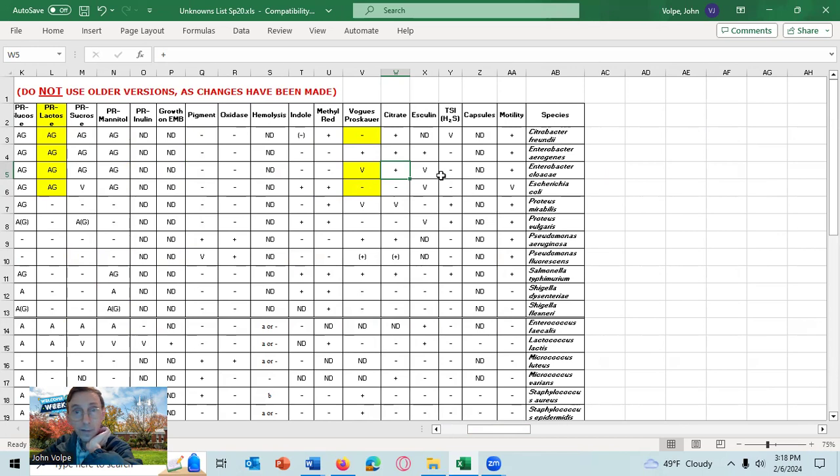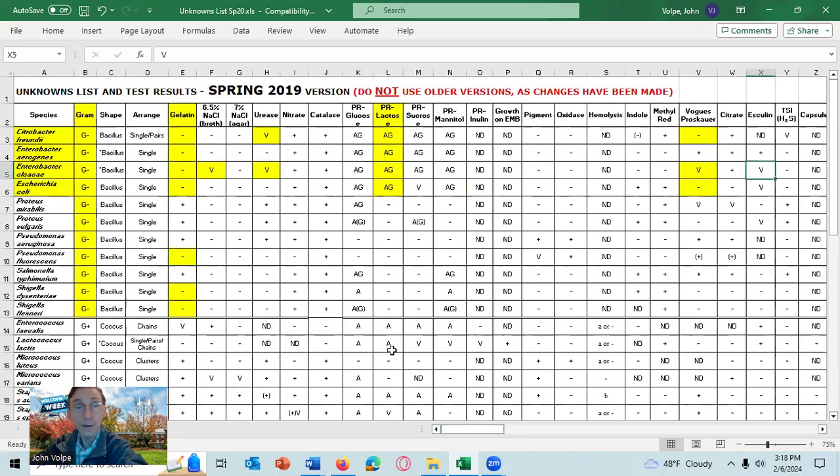You could run this one and hope it's negative. Of course, that doesn't narrow out that one or that one. Anyways, the point is, after you have it narrowed down to one, you may do one additional test at no penalty. And this is a confirmation test to confirm that the species actually is the one you think it is. Do not do more than one confirmation test, otherwise there will be a penalty.